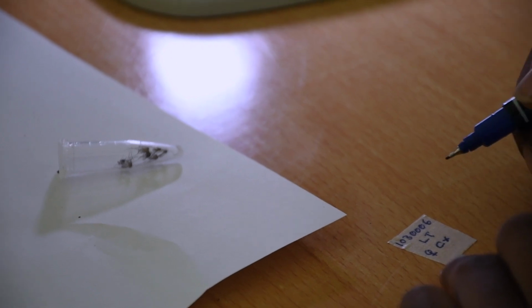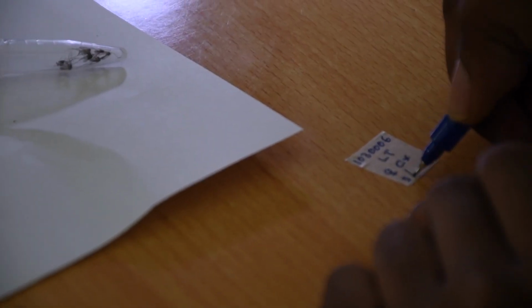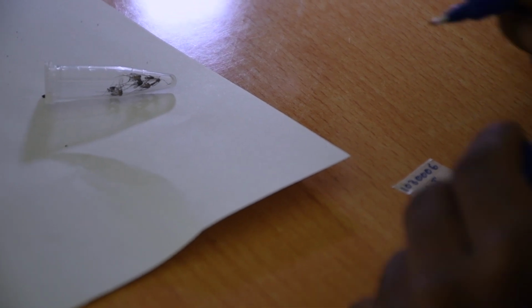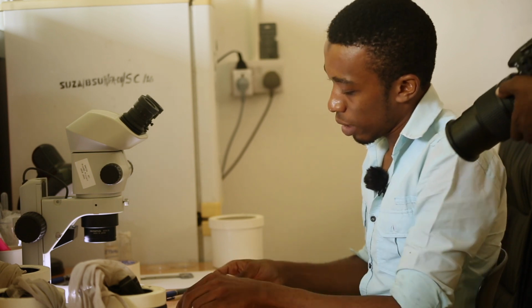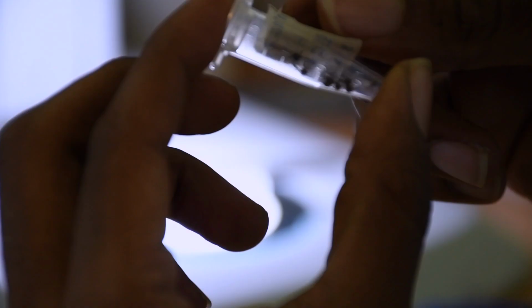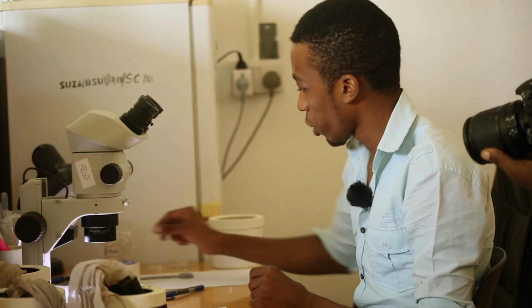CX stands for Culex, and the date of today, which is 5th of April 2022. So this is the sample label, which we would then stick to the Eppendorf tube, and it can be kept later for storage.